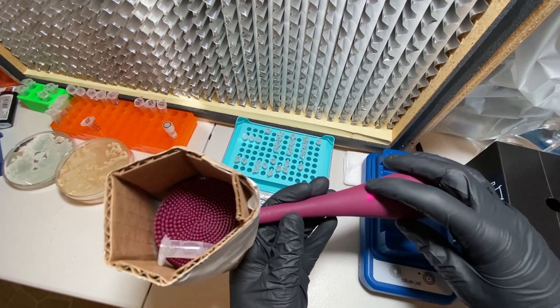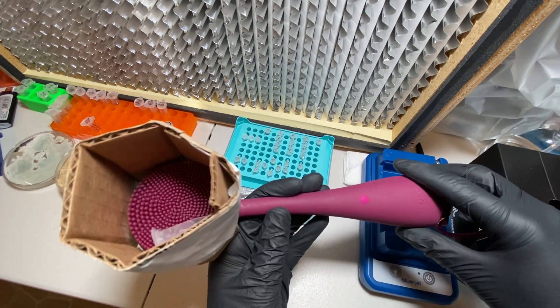So there you have it: a cheap DIY vortex mixer using a personal hand massager.